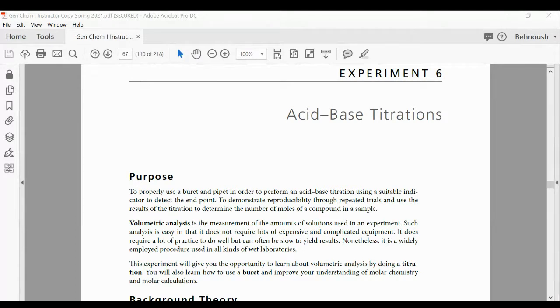That's why we use pipettes and burettes, because they have very high accuracy when you're measuring volume. They're the most accurate equipment or glassware in the lab for measuring volume: volumetric pipette, graduated pipette, and burette. You can record the numbers with 2 decimal places, and they are very accurate. So you can find the volume. The compound with the unknown concentration would be your unknown.